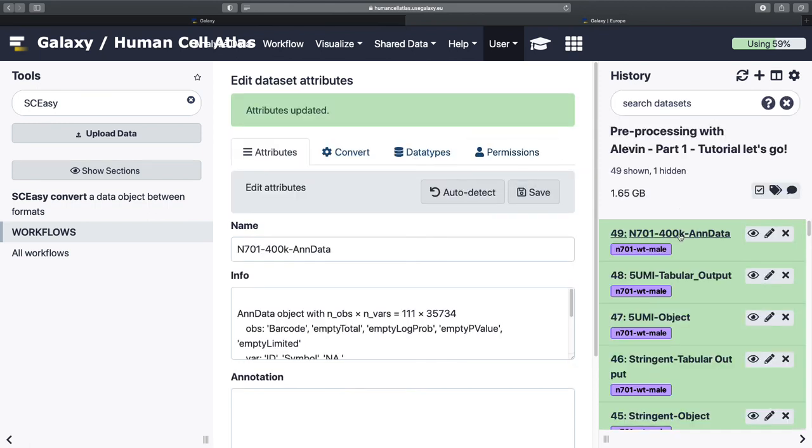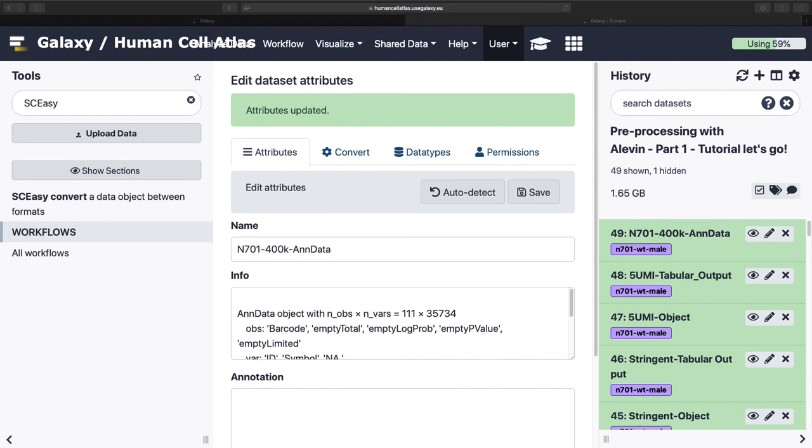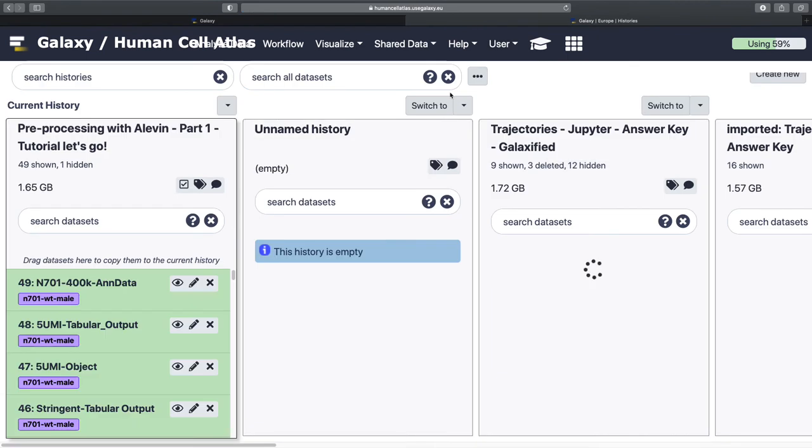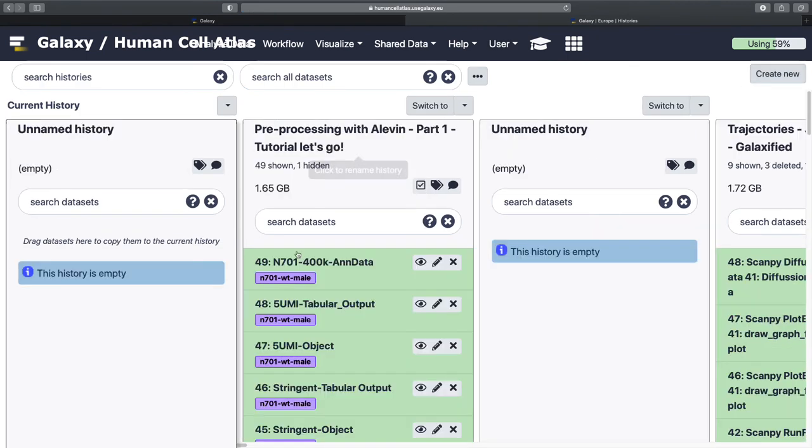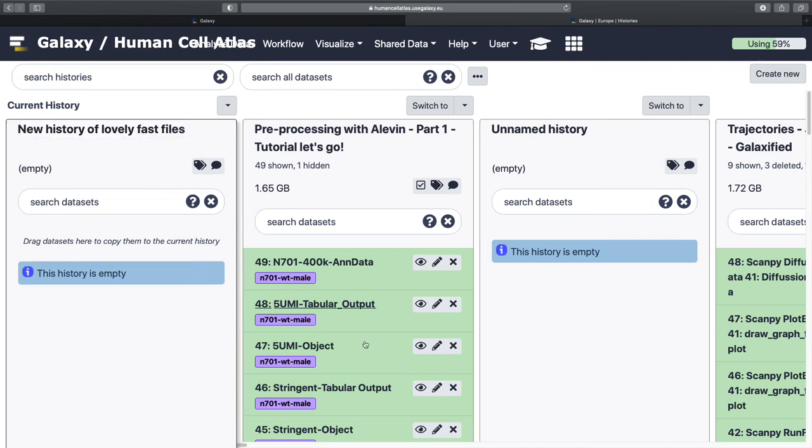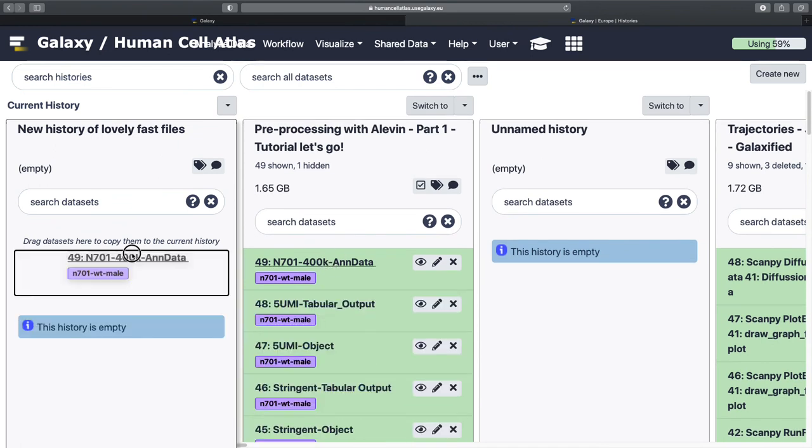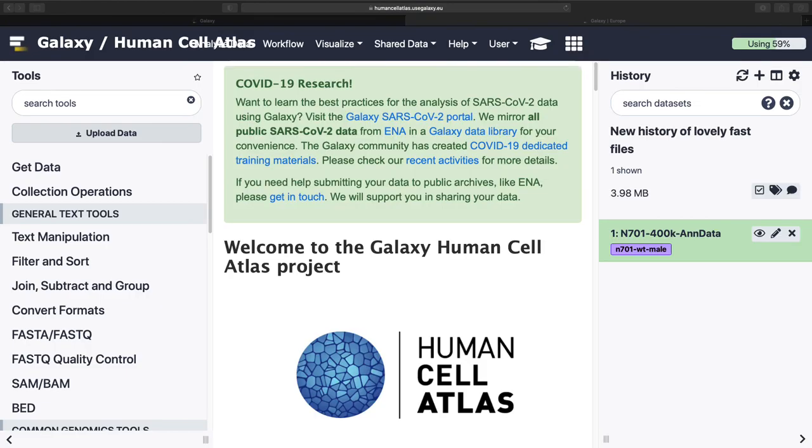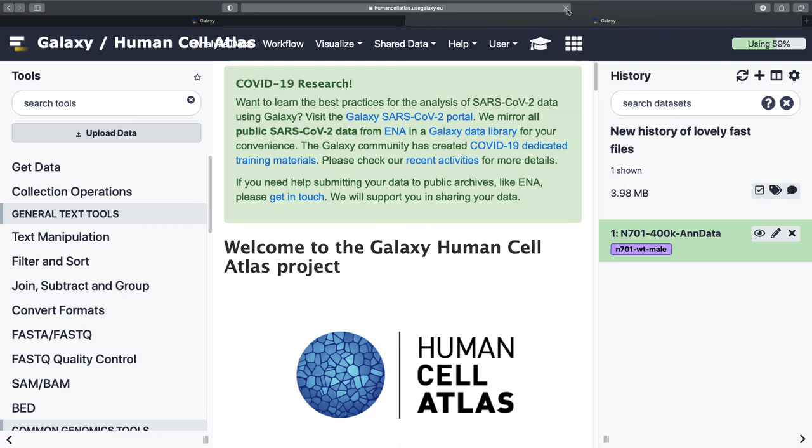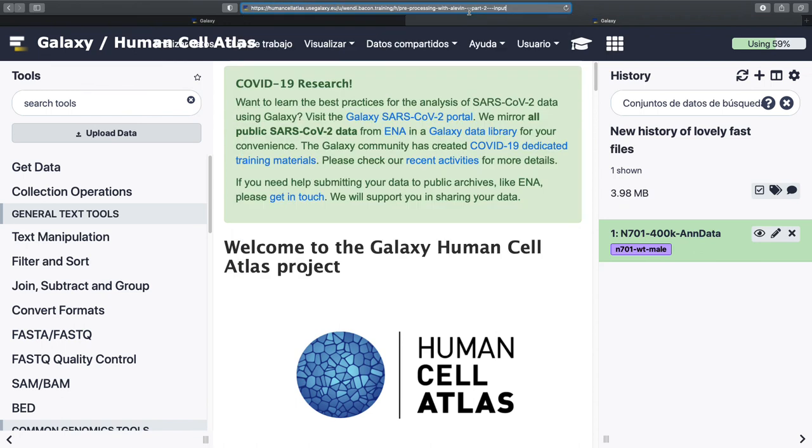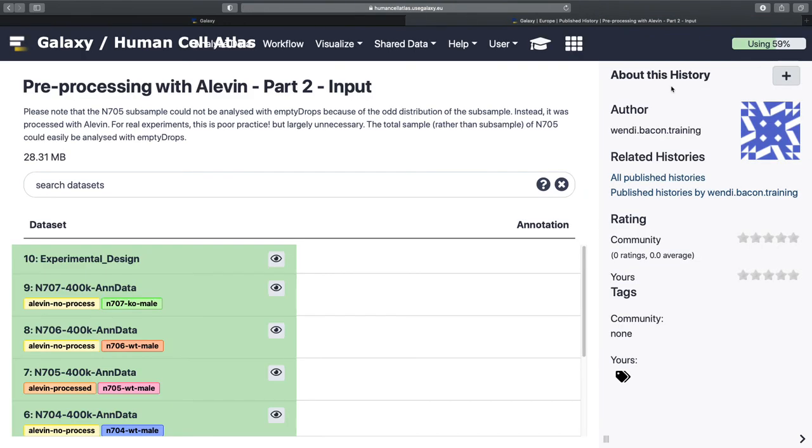However, it is only actually 400,000 reads of the total thing. And there's only really one lane where you might want to be combining multiple lanes. And thus we hit the second half of the tutorial. This is where we're combining FASTQ files. Now, you're very welcome to go through this entire tutorial six more times or indeed seven if you want to get the full FASTQ data. So you'd have to redo this as well and then put them together in history. Top tip for that. If you're working on it, you'll see all my messy histories, is that when you create your new history, it's my new history of lovely FASTQ files. And let's say you've done this a whole bunch of times on your different data sets. You can just click and drag over and then you can start with your new history and it's brilliant. But we're not going to do this a bunch more times. So instead, we're just going to grab the input history. So I'll open that link again.